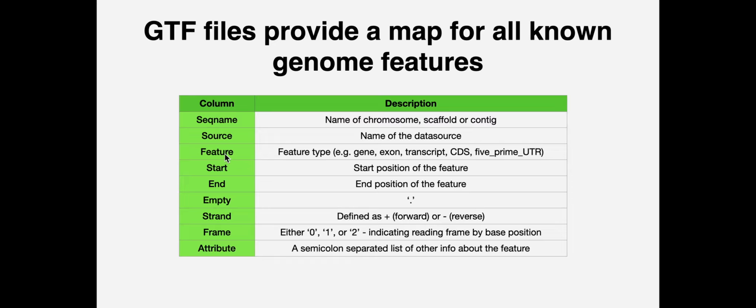And so you can imagine this text file is huge. In fact, the one that I point to in this code chunk is almost 4 million lines long, because it's got annotation information or positional information for each element in the genome. So every gene, every exon, every transcript, every 5' UTR, 3' UTR, coding sequence, you name it.